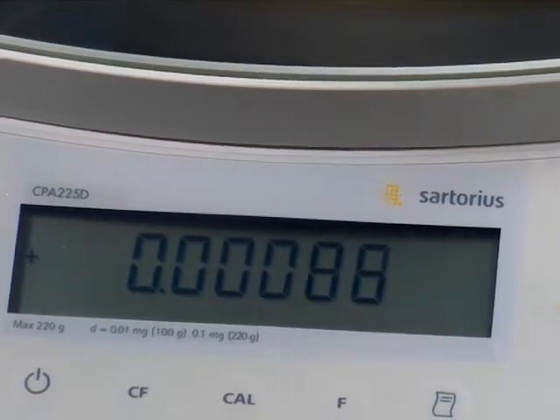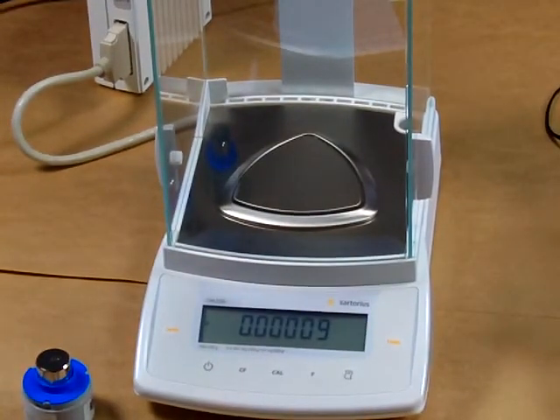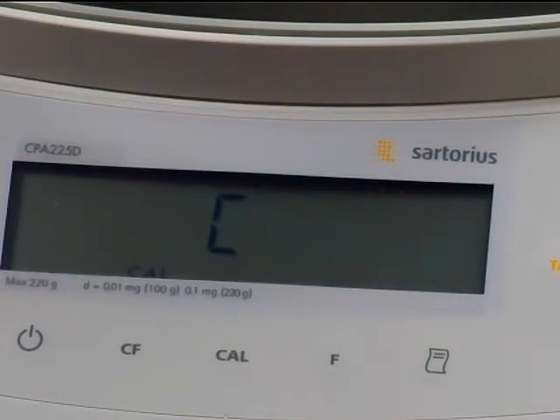Another beauty about Sartorius is you have motorized internal calibration. By simply pressing the CAL button, we can calibrate the balance. We'll first zero the balance out, then press the CAL key. It initiates the calibration — you have motorized internal calibration here.